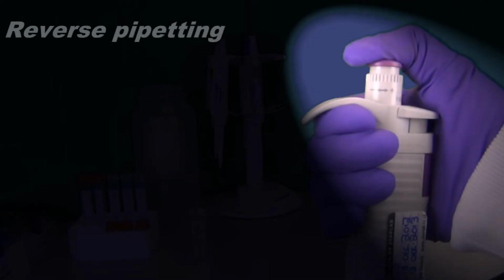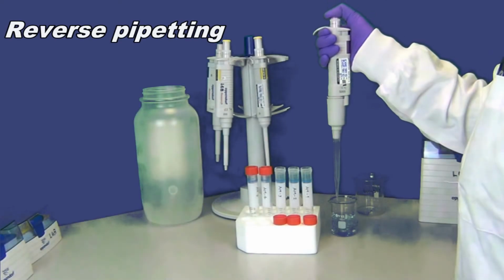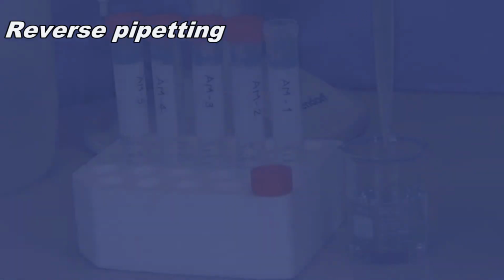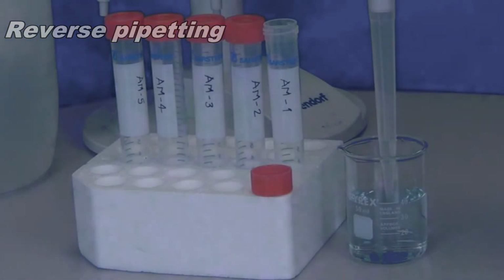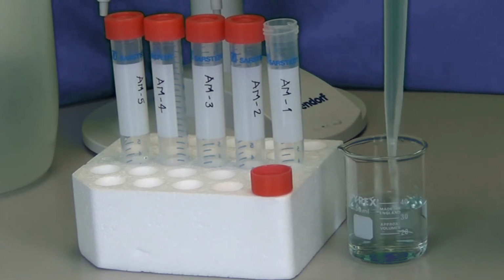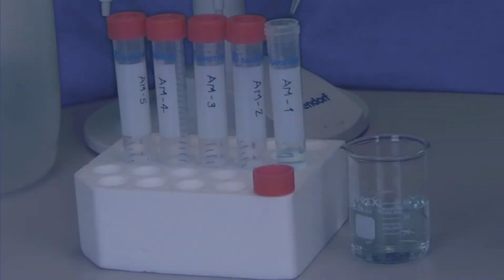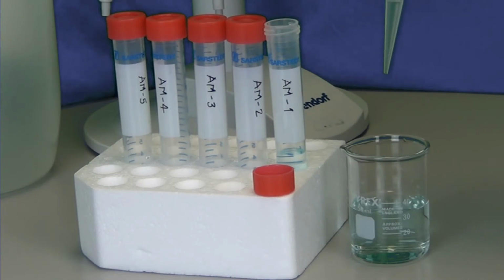Press the operating button down to the second stop. Immerse the tip a few millimeters into the liquid. Release the operating button slowly and the tip will fill up with the liquid. Dispense the liquid by pressing the operating button down to the first stop. Some liquid will remain in the tip and can be discarded. Replace the tip to avoid sample contamination.